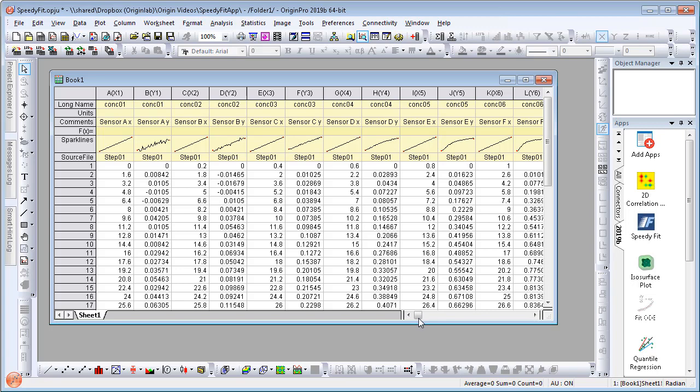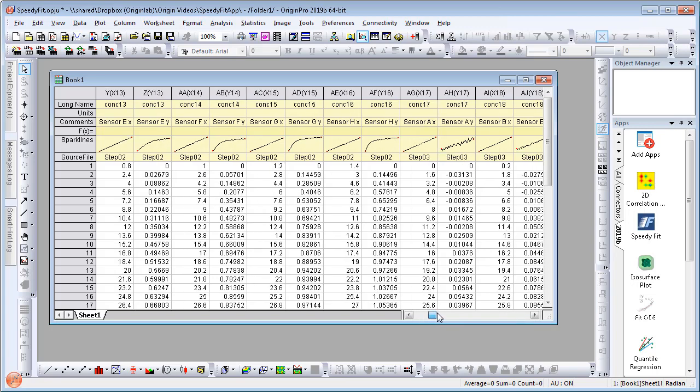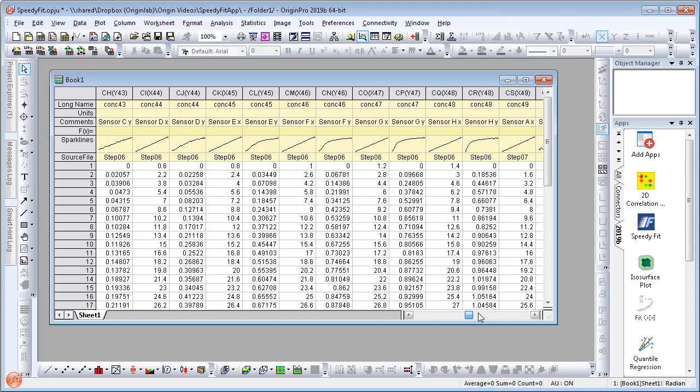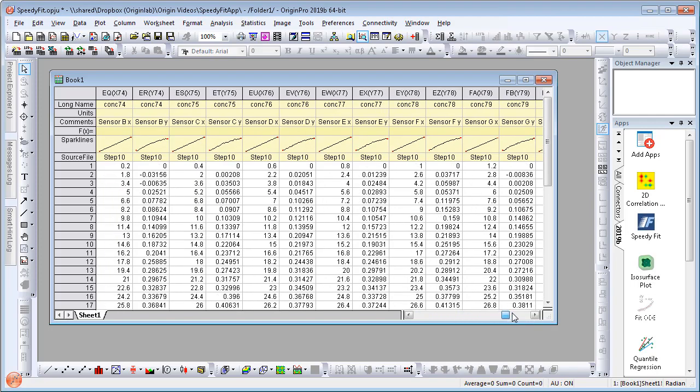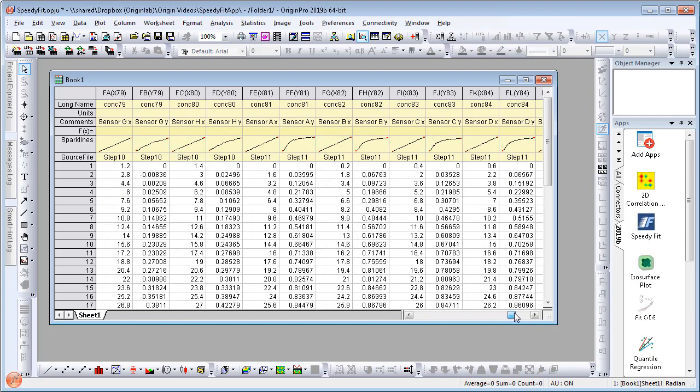In this example, I have a worksheet with 96 pairs of XY data from measurements at different concentrations. Let's see how we can perform a quick fit to this data with this app.